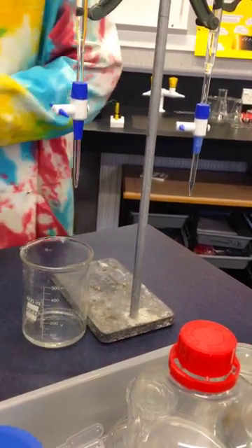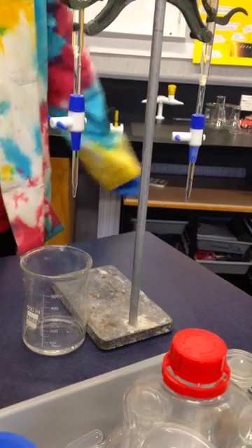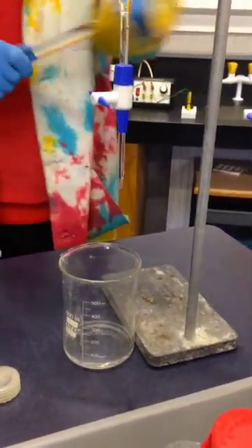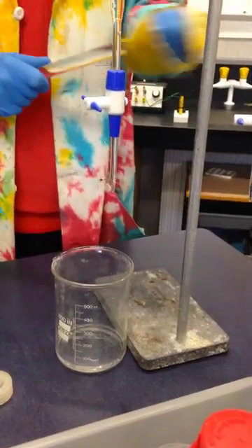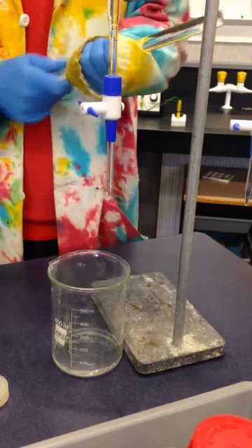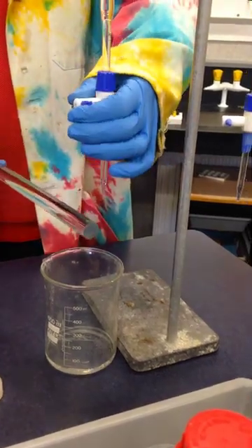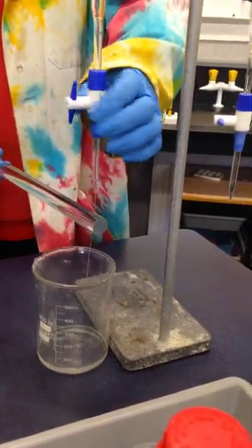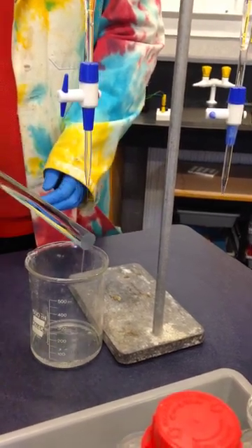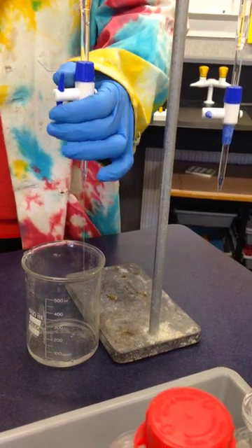I can also take the glass rod and do the same thing. We don't know what charge is on these rods at the moment. That could be positive or negative. We don't know if electrons are being put onto the rod or taken off the rod. We could do some fancy electrostatic tests. So it doesn't really matter what charge is on these rods, the water still gets attracted to it.